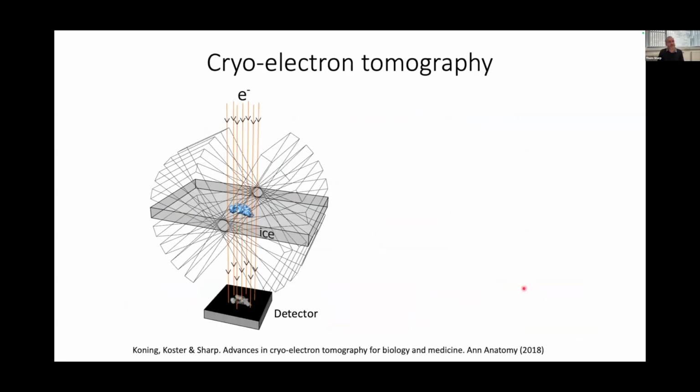How do we collect these kinds of in situ data? Well, we use a technique called cryo-electron tomography to get these 3D data. Cryo-electron tomograms are collected in much the same way as an MRI or a CT scan, in that the same region is imaged from multiple angles.